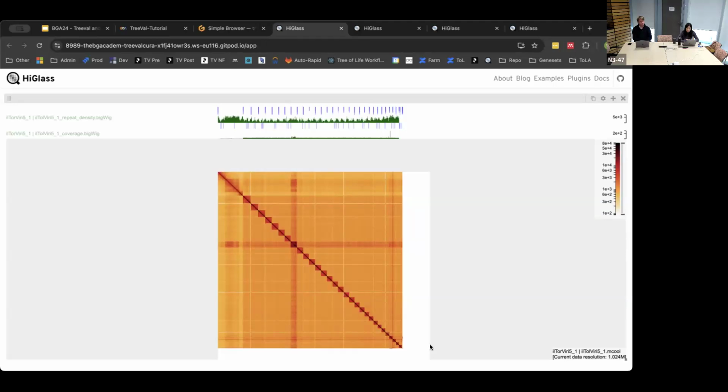So you can see on the top, that might be the telomere track, and the third line can be the gap track accordingly. It doesn't have the label, so you should remember what you load first. How do you fix that? It's in how you load the tracks, it's a different value you have to set rather than the name. It's not the name. It's going to set a different label. I can show you later.